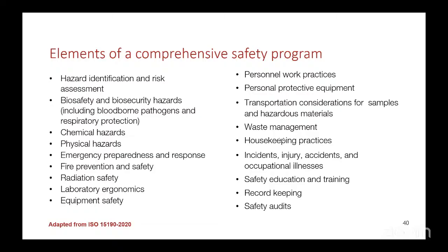Okay, someone said I should explain safety audit. Any other one? So when we talk about a safety audit, it talks about auditing the safety program. You need to be trained as an auditor. You need to have adequate knowledge of the safety program. Then you need to have a safety checklist, a program and schedule, a policy on safety, and SOPs on how to conduct the safety audit.